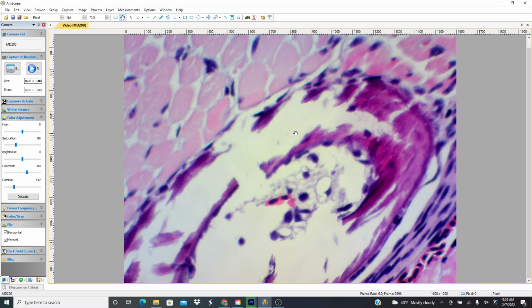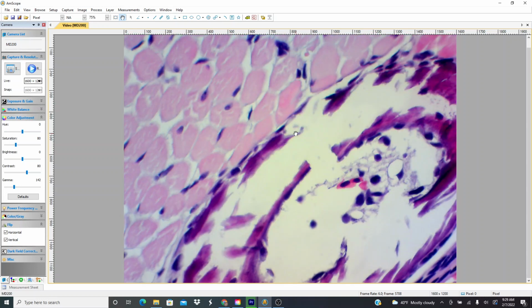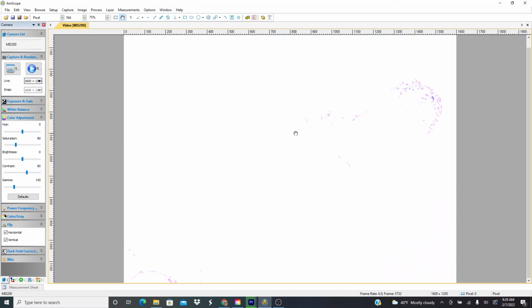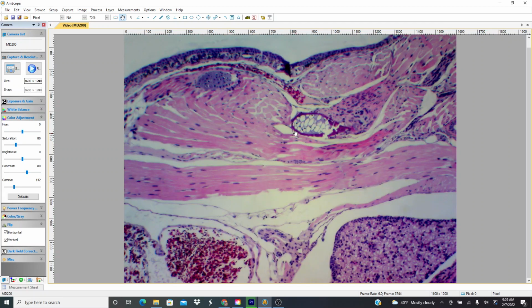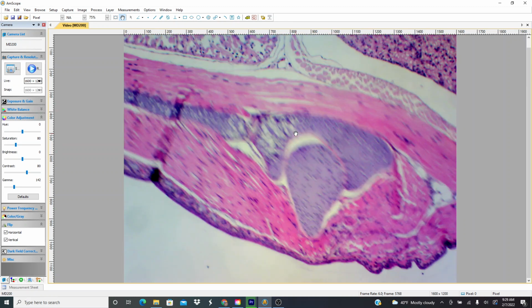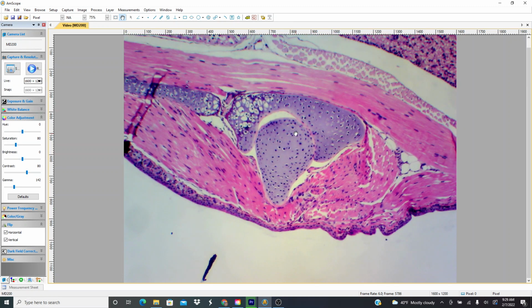What that might be is actually bone kind of shattered by the knife that cut this tissue. There might actually be some bone in this thing, but there's not much. Let's go on the other side, see if we can look at the other arm. See, this looks like a joint.